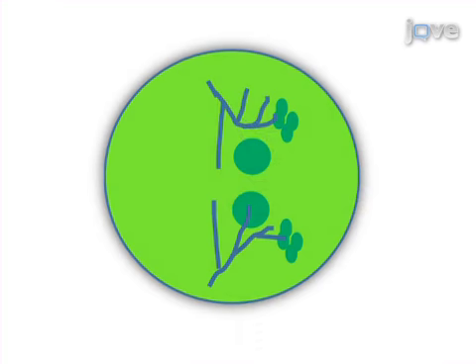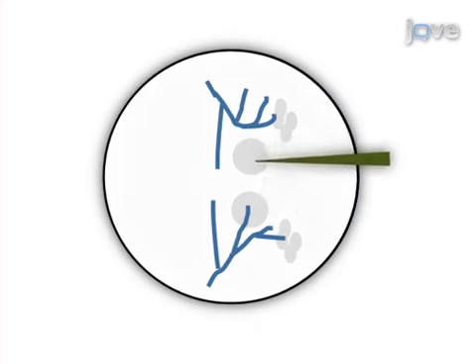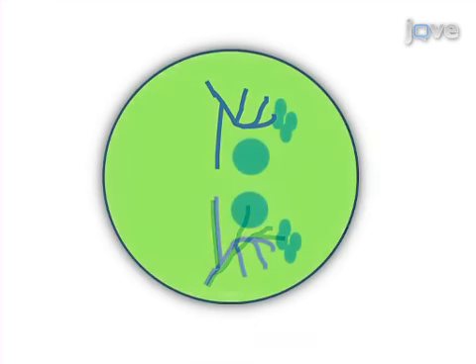At this point, bright light is used to remove the remaining debris that cannot be seen with fluorescent light through a GFP filter. Ultimately, the cleaned motoneuron 5 can be seen faintly in bright light, but seen well using fluorescent light with a GFP filter. After rinsing the cells with saline for 15 to 20 minutes, they are prepared for subsequent in situ patch clamp recordings.